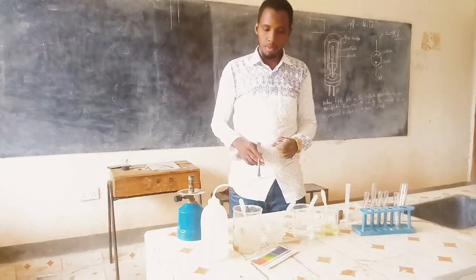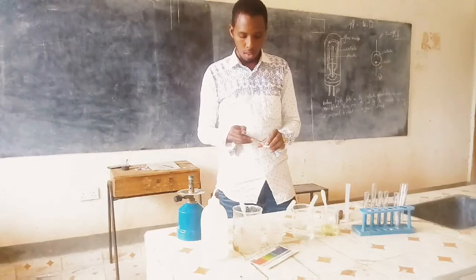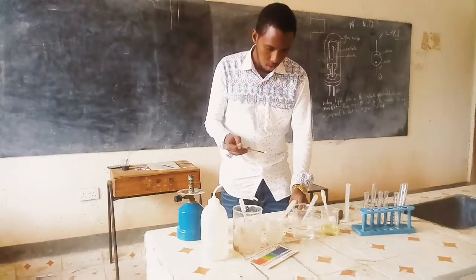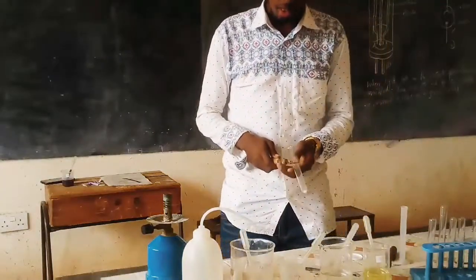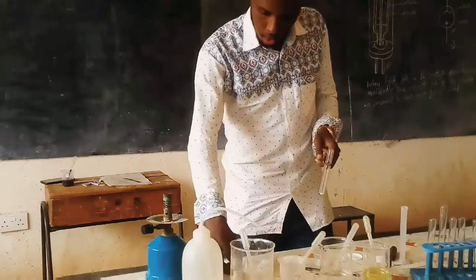So the first procedure, Anion takes about 1/3 of solid H in a dry test tube. Then you heat solid H and test gases being produced with blue and red litmus paper.